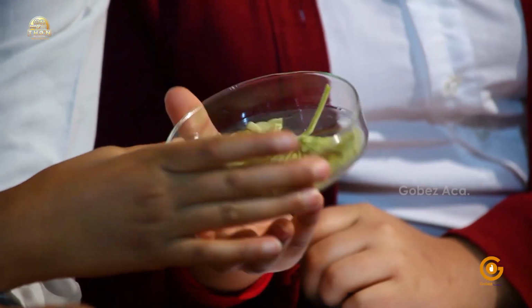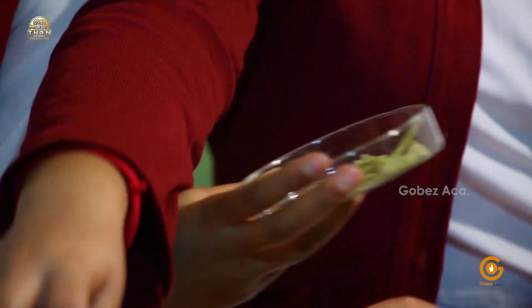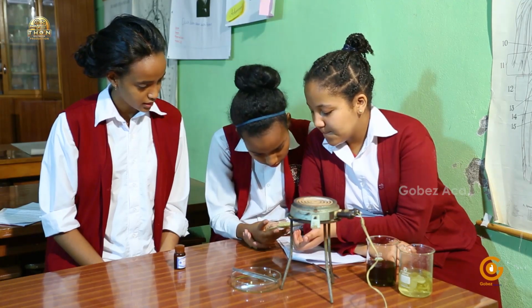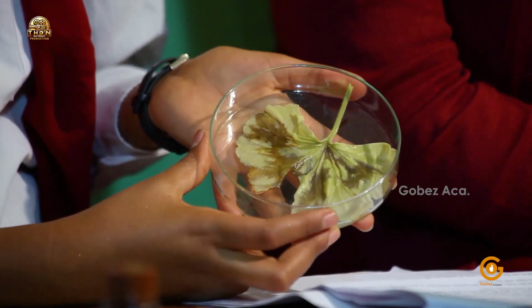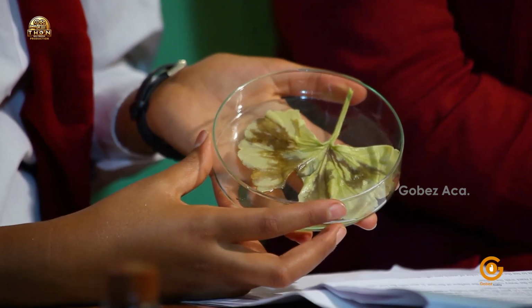It's turning blue black. It's very strong.